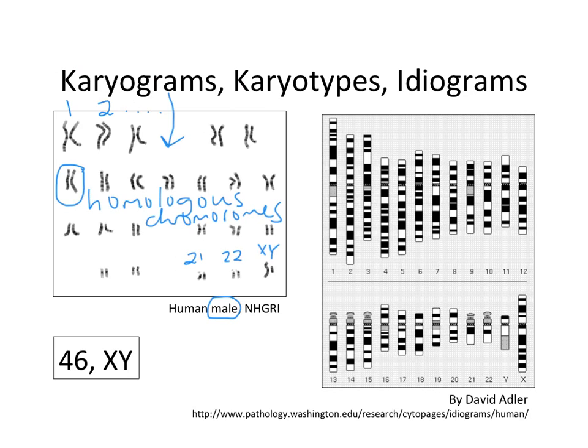There's another closely related term that we use, a karyotype. And a karyotype is simply a text description of what we learn from the karyogram. So the karyogram displays, in this case, 46 chromosomes, and this is an XY or male.